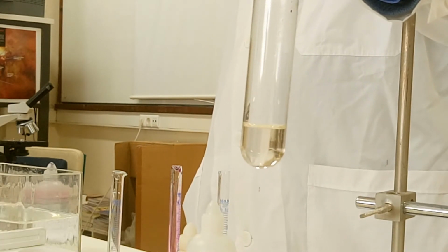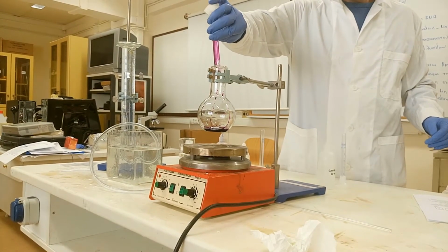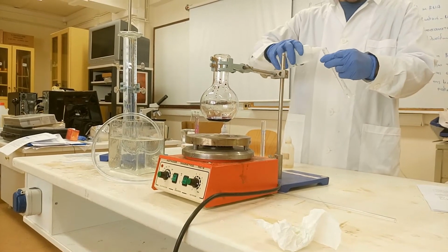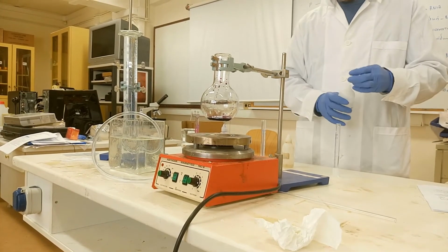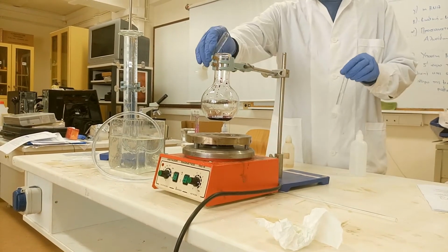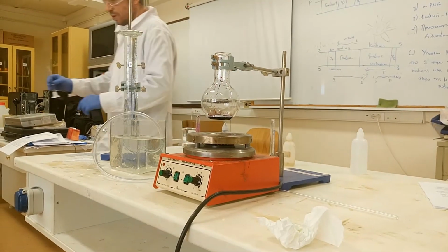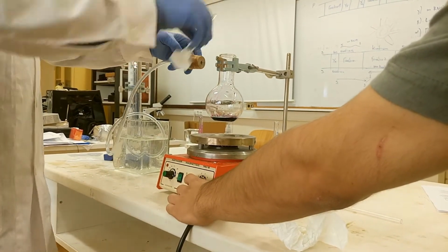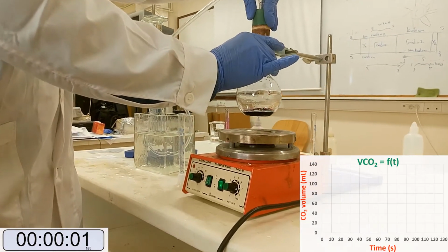To quantitate the kinetics of this reaction, we set an inverted graded cylinder in water, a spherical flask with a magnetic stirrer and a stopper, and a tubing to collect the carbon dioxide produced and measure its volume by time. We add the same amounts of potassium permanganate, sulfuric acid, and oxalic acid as previously, start the stirrer, place the stopper, and start the stopwatch.